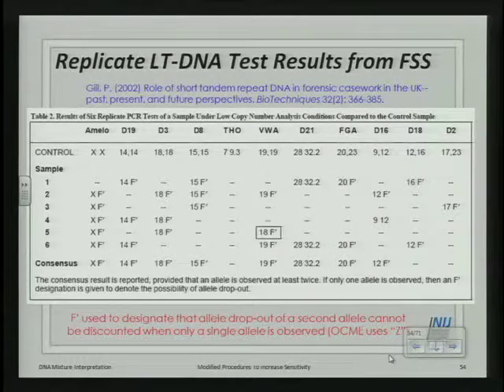And so they gave the F designation there as there's a potential that there may be another allele. We're not 100% confident that this is a homozygote, but we'll give this F designation as it was perhaps a failure to amplify the sister allele. In this one case here, 6 replicates, they did see one case here in this box of an 18 allele, which is a drop-in. Most likely, perhaps, a stutter.